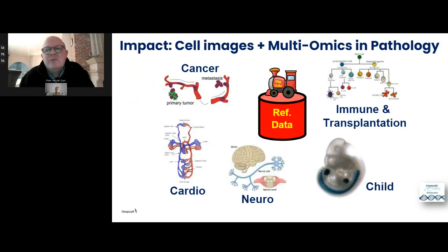So what I'm now going to do is guide you through the areas where we think are the highest potential to apply the technology, and I'm going to outline 2 of our experiments that we have done for which we have very clear results. So of course you can apply it in cancer research, in cardiology, neurology, immune transplantation, and in pediatrics. In particular, one of the examples that I'm going to illustrate looks at PBMCs, blood cells. Well, of course, the blood is very important and easily accessible in diagnostics in a hospital. So from that perspective, we wanted to do a study where we look at blood.